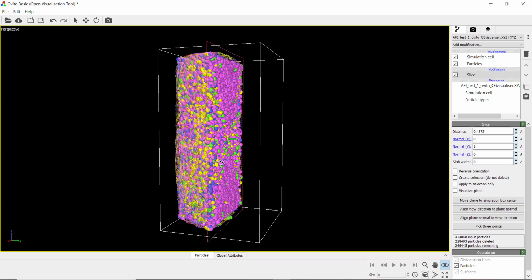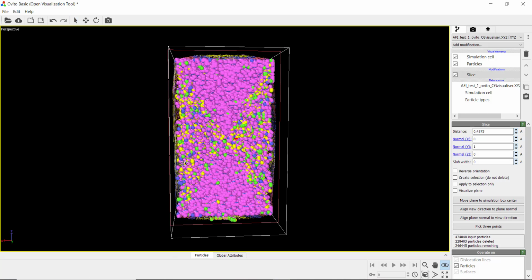And it's reversed, so if I spin around. And you can actually start to see something here. So we've got a nice hourglass feature in the middle here. This is shown quite clearly by our purple and blue species in the system.